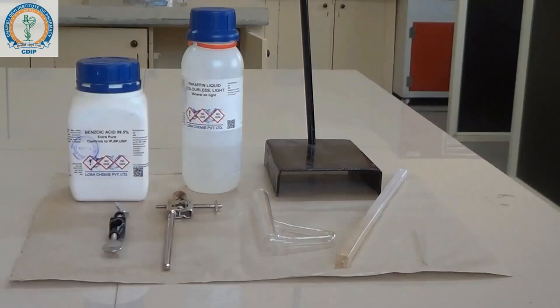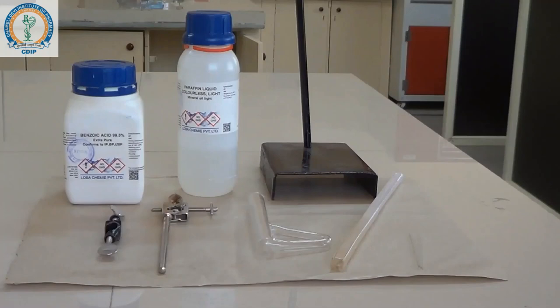Melting point is the temperature at which a solid substance melts and becomes a liquid. Generally, a pure crystalline substance has a definitively sharp melting point. The melting point range, which is the difference between the temperature at which the collapse of the crystal is first observed and the temperature at which the sample becomes completely liquid, should not exceed about 0.5 degrees centigrade.